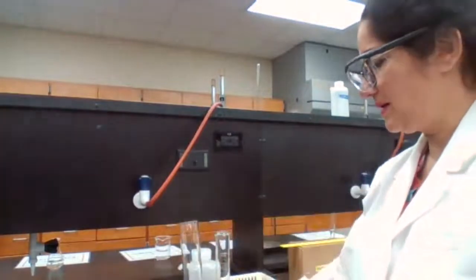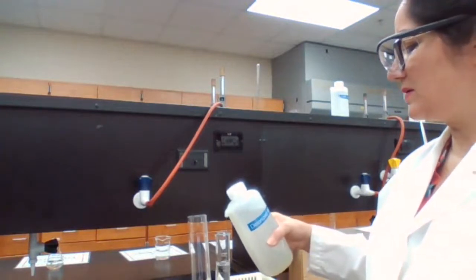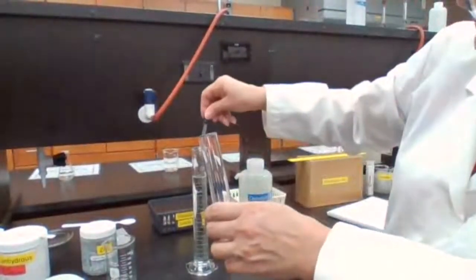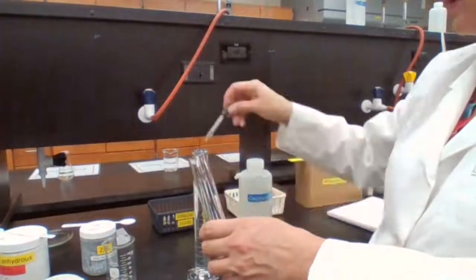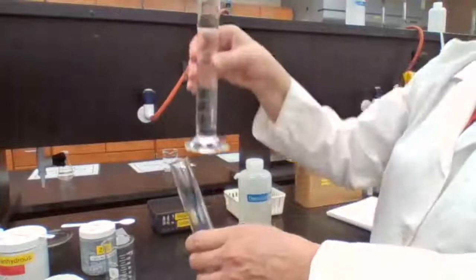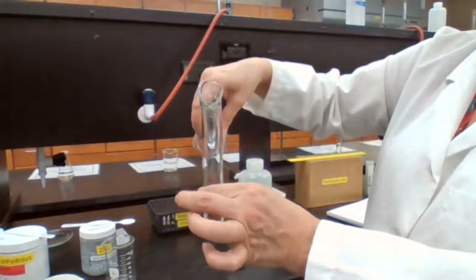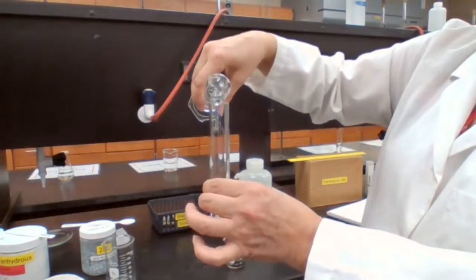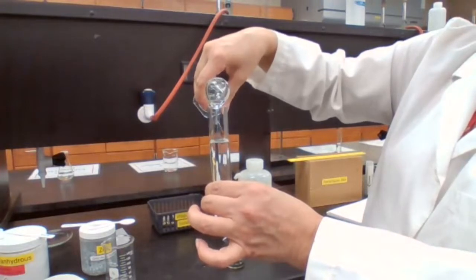We can use 100 ml of water. We can fill up the graduated cylinder to exactly 100. And I learned my lesson: I have to adjust the top to reach the exact volume using a dropper. So I have 100 milliliter almost. I have 100 milliliter of water in the graduated cylinder. Now, I transfer water carefully without spilling any water out. I transfer enough to fill up this test tube exactly to the top, completely filled up to the top.